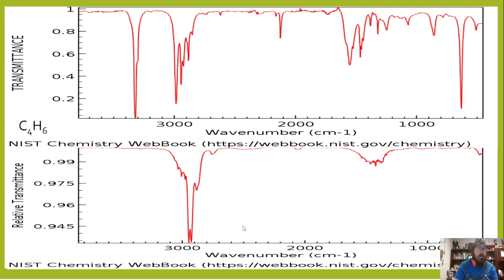So this is kind of how we can use this. We're going to use this in addition to our NMR to go, oh, okay, there's an alkyne. Oh, there's a nitrile. You typically have a molecular formula. You can typically find an unsaturation index. And we'll use this to try to find key functional groups that we're going to build off of. So that is how we can use the NMR. That is how we can use the IR. And then hopefully this will be a review.